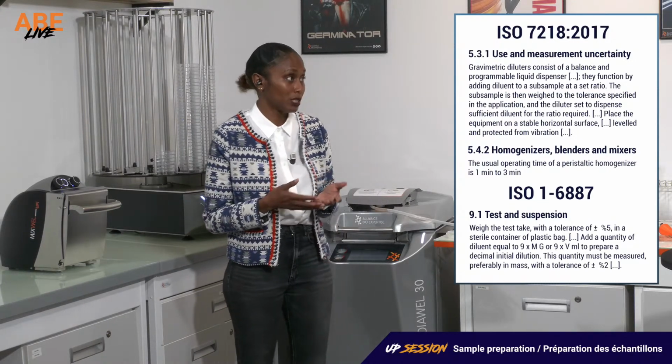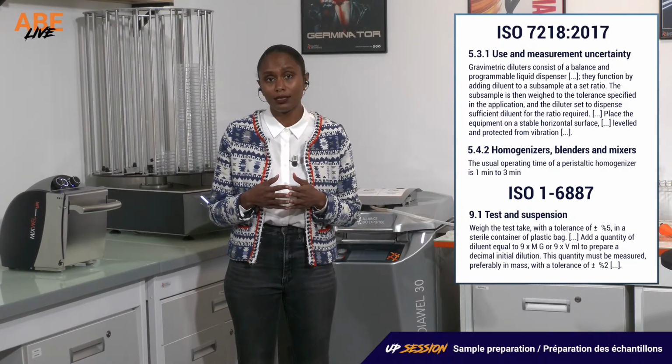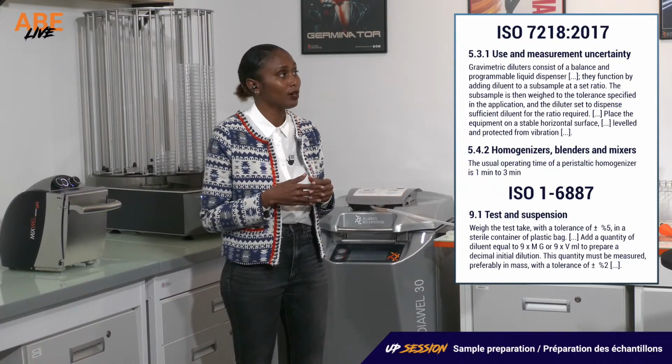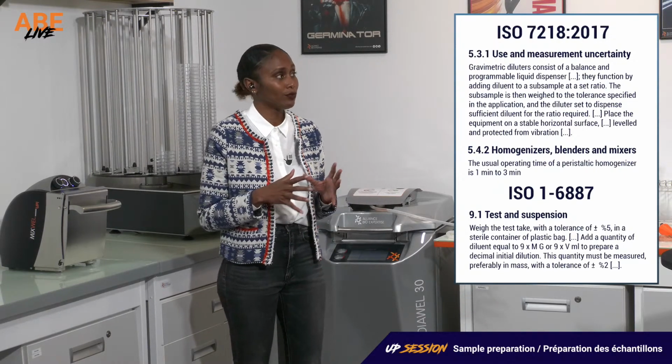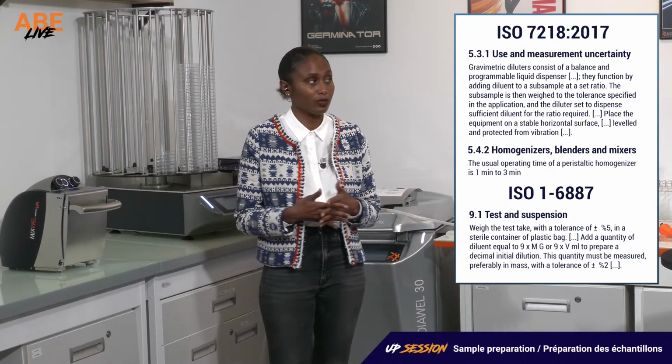Because it's a precision scale, in the standards, it is specified that it should be on a plane level and that it should be away from vibration. So this is for the first step, the dilution.